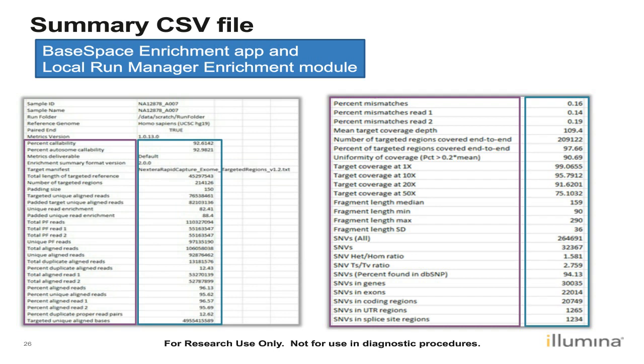For example, we have here percent aligned reads. This is always a good metric to take a look at. We're getting just above 96% for this sample, which is great because we are expecting to align to this human genome because it was a human sample. So the fact that the majority of our reads are aligning is a great first step to understanding how our sample is doing.